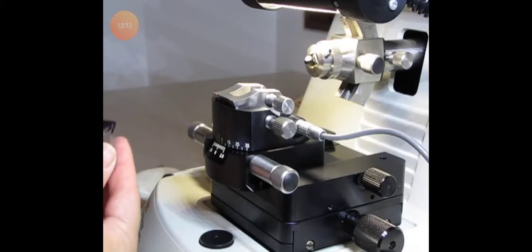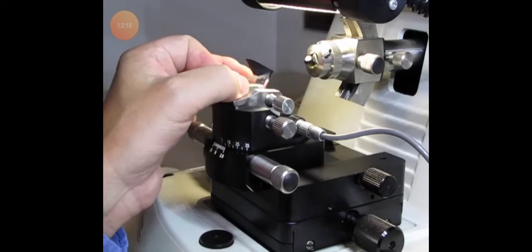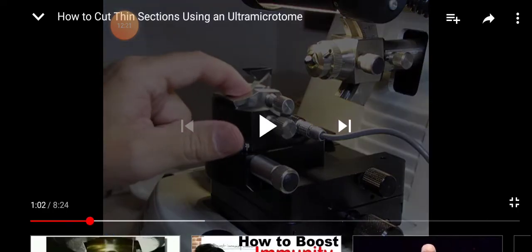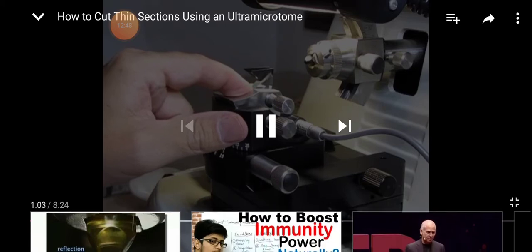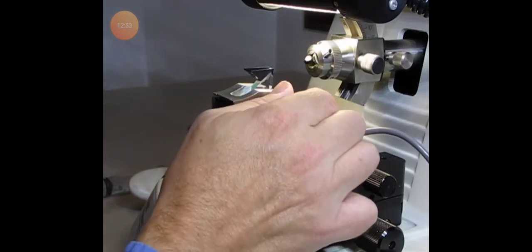Now we need to put a knife into the knife holder. Here's a knife already prepared with a boat, and that goes into the knife stage. So this is the knife which is inserted. Okay, it may be a diamond knife or a glass knife. Most often a diamond knife is used, and you can see a small black trough attached to it, and in this small trough water will be filled, so that the sections which are formed will be falling directly into this water. Push it up against the forward stop and also against the side, and then tighten the screw on the knife stage.